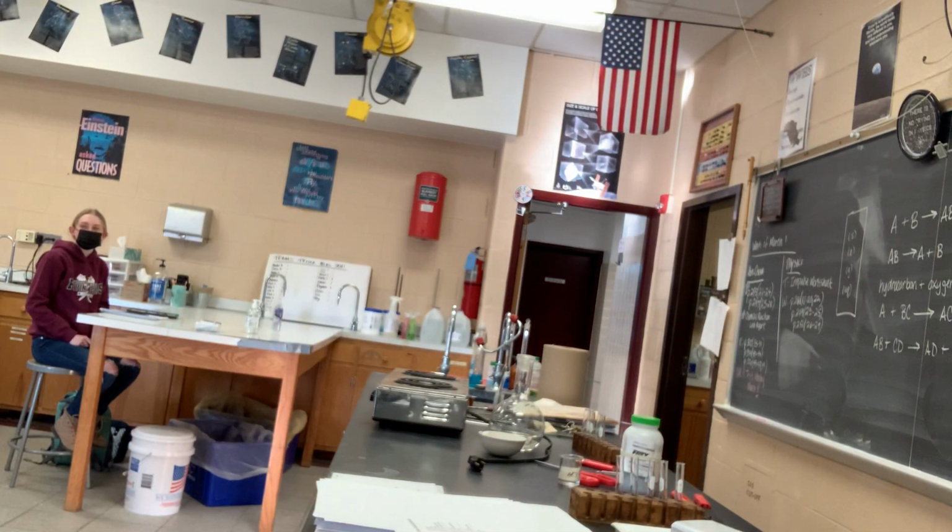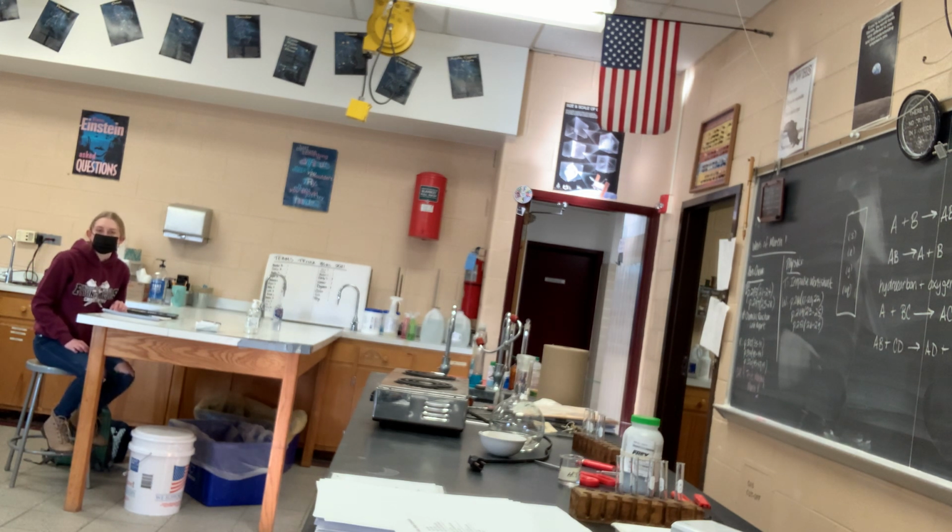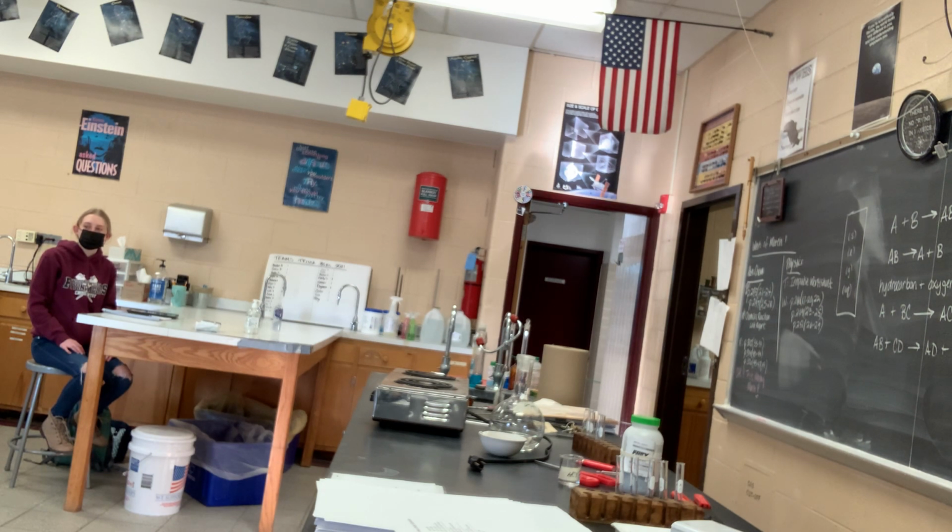Okay, so you can see there's definitely a chemical reaction going on there. It's producing a gas. It looks like the zinc is disappearing. Okay, light the match and then don't jump. Did you hear it? Yeah. It wasn't a very impressive blowout. I can capture more. So that's two reactions.